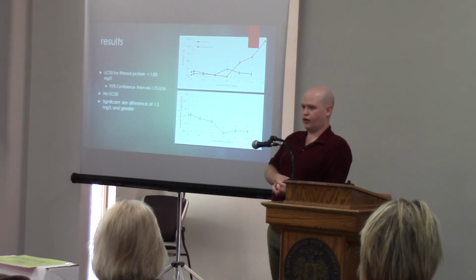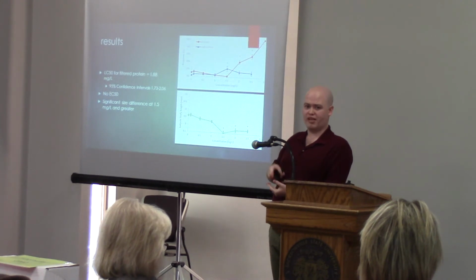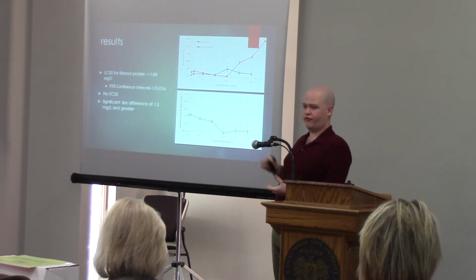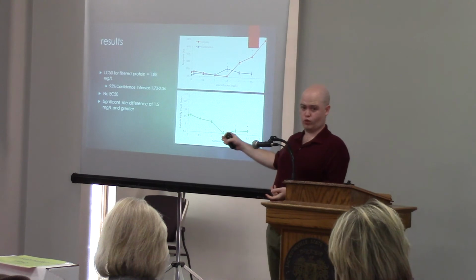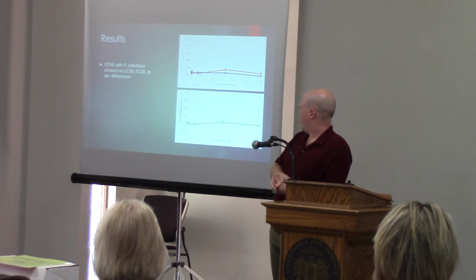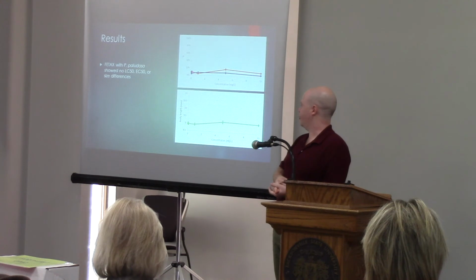These are the results from our filtered experiments, so a giant apple snail egg protein that was sent through the strong cation exchange column. Our LC50 here went from 0.55 to 1.88. So we basically tripled the LC50, or more than tripled the LC50, by simply running it through a filter. We still couldn't find an EC50, we still didn't really have very high malformation rates, but we did find a statistical size difference that was consistent after 1.5 milligrams per liter.